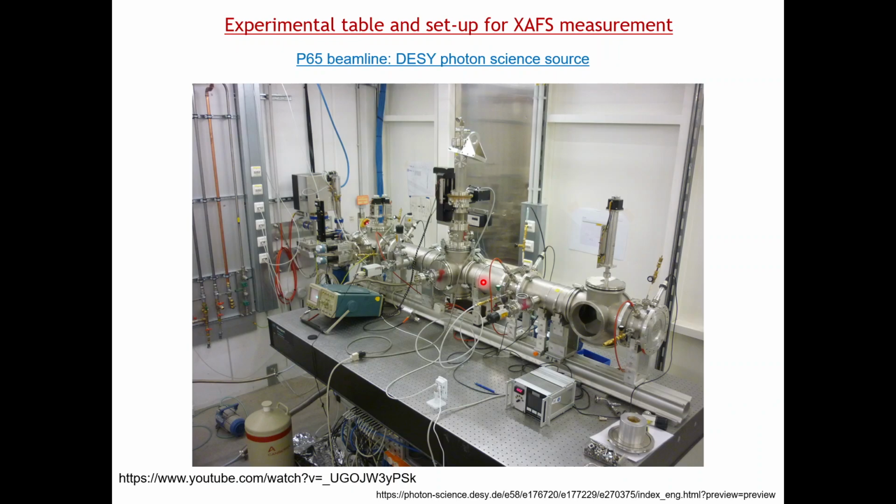So this is a typical beamline setup. This is taken from the P65 beamline, where we went to perform the experiment last time. This is at the PETRA III photon science source.